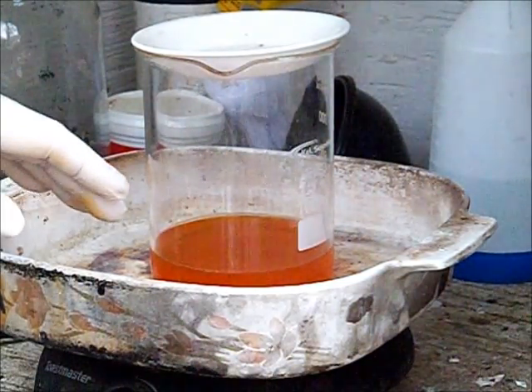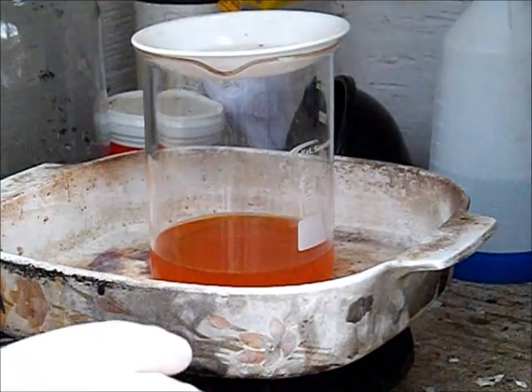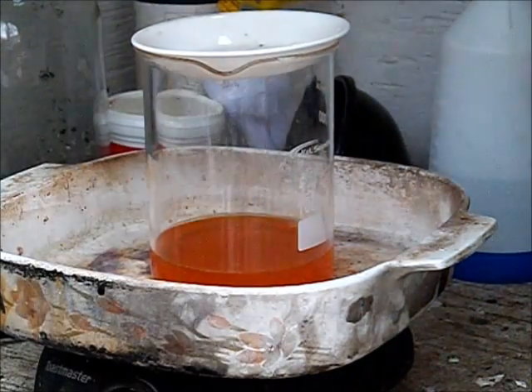So there may actually be more nitric acid in there than I intended. I'm going to let this settle, I'm going to decant, and let me grab a filter.